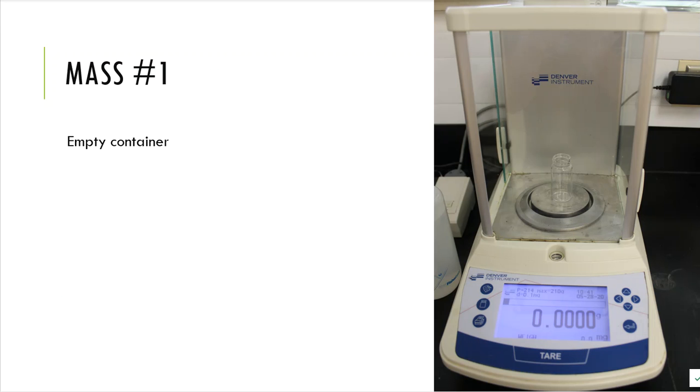So 0.0000 gram. There it is. All right. So there's my empty container. And then it tells me to take like 1.1 milliliters and add it to the container. Whatever. We're not doing that. I'm going to modify this laboratory procedure. And we can do that if we're allowed to do it sometimes, as long as we make notes of what we did. No big deal at all.